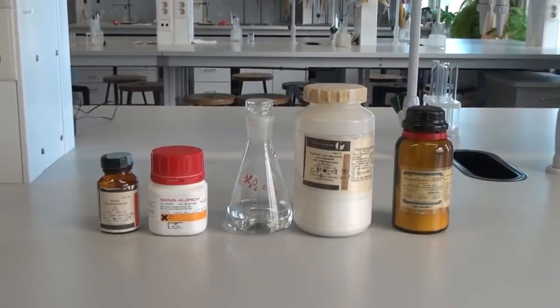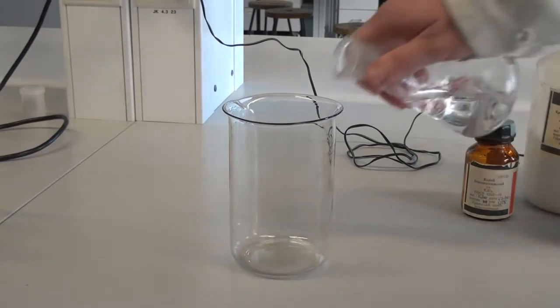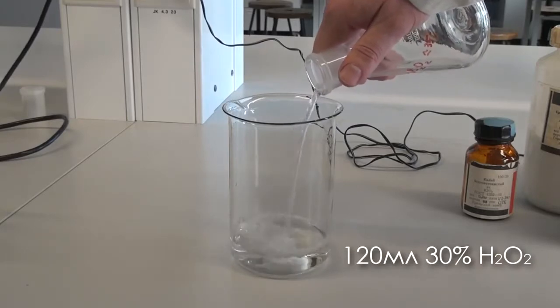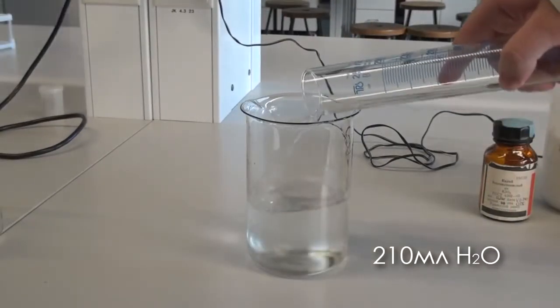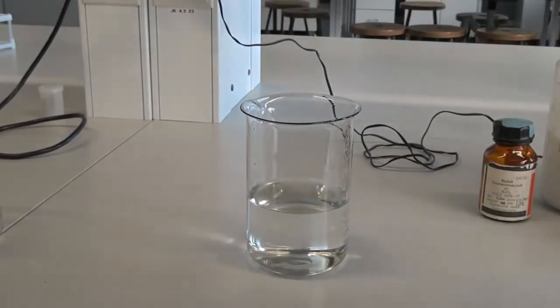To conduct this reaction we'll have to prepare three solutions in advance. The first solution is quite simple. Take a large beaker and pour 120 milliliters of 30% hydrogen peroxide, then add 210 milliliters of distilled water. And here we have our first solution.